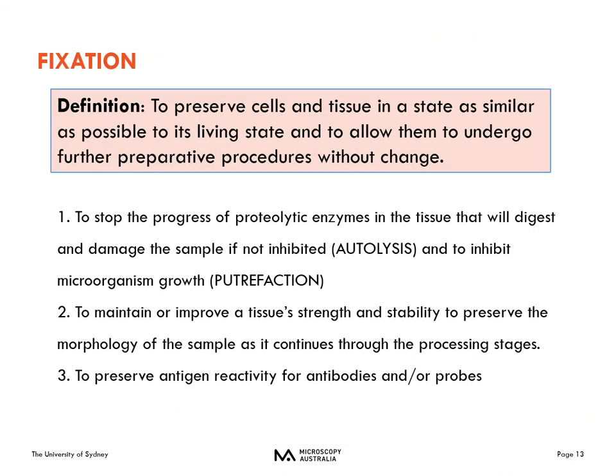The definition of fixation is to preserve cells and tissues in a state as similar as possible to their living state, and to allow them to undergo further preparative procedures without change. It aims to stop autolysis and putrefaction by bacterial growth, to maintain or improve the tissue strength and stability to preserve the morphology of the sample as it continues through the processing stage, and also to preserve antigen reactivity for antibodies and fluorescent probes.